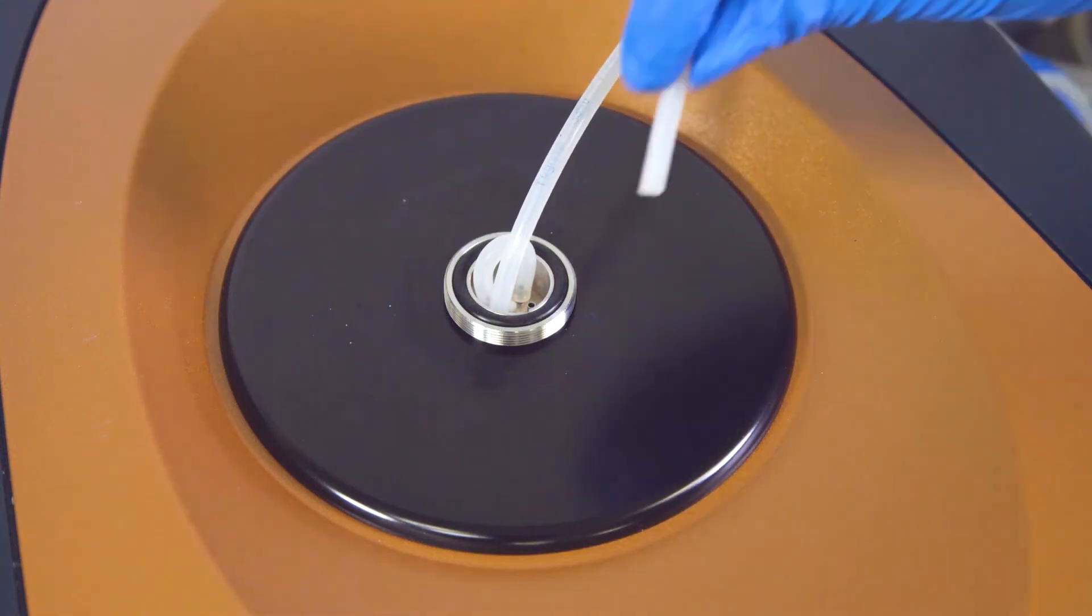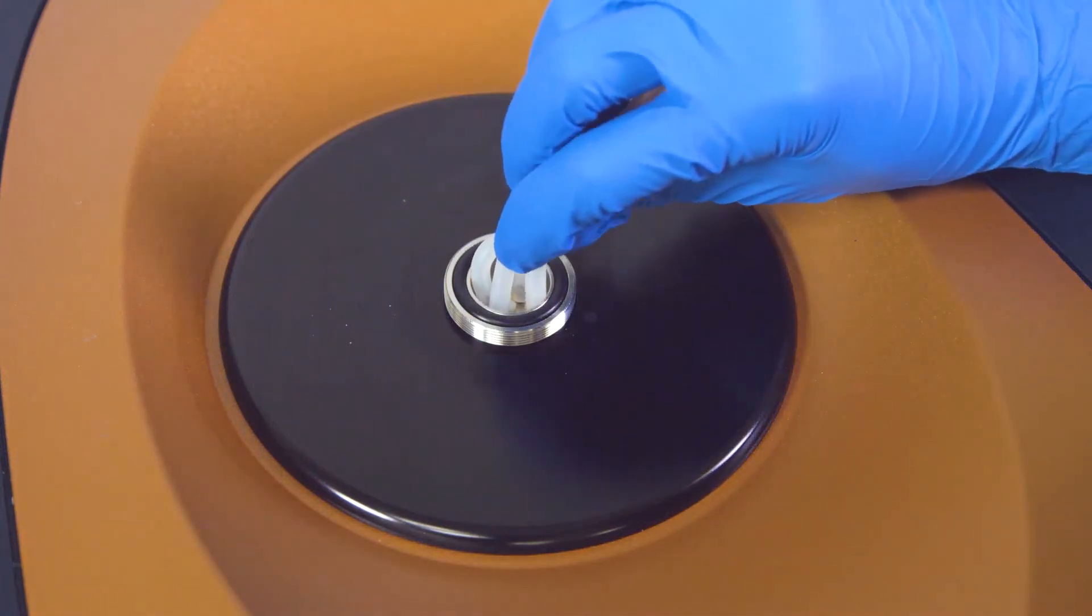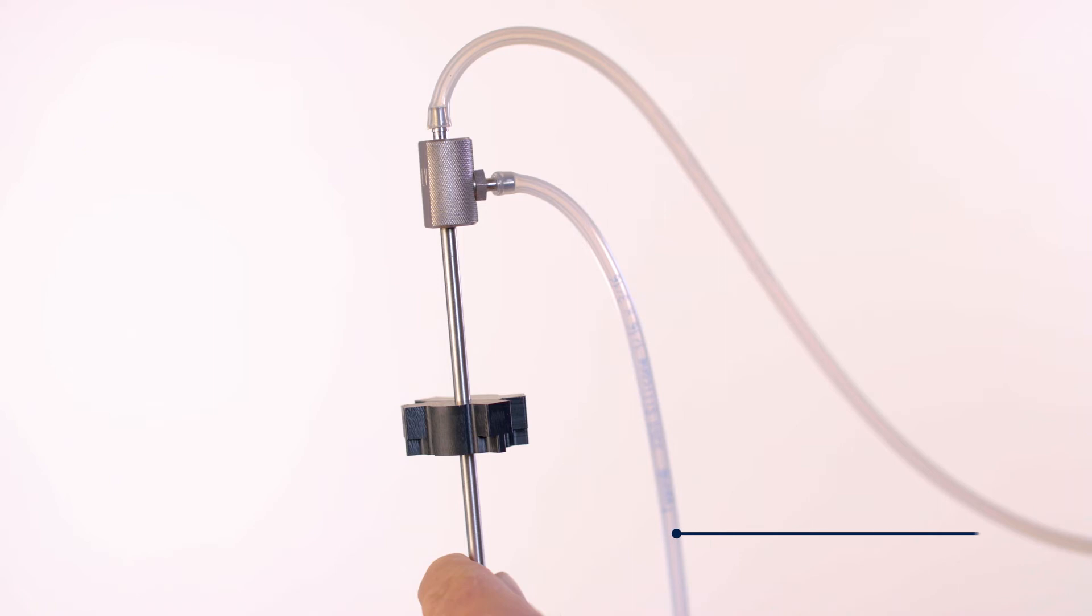On the NanoDSC, the hose can be connected directly to the cell or reference access ports. Cleaning the ITC requires the use of the cleaning tool, where solvent is pumped into the side and out of the top of the tool into the waste container.